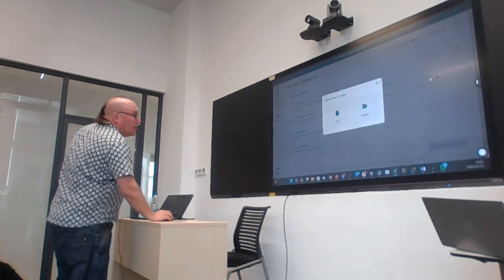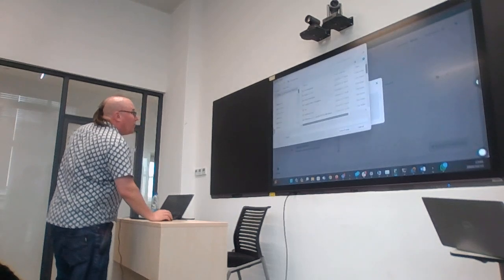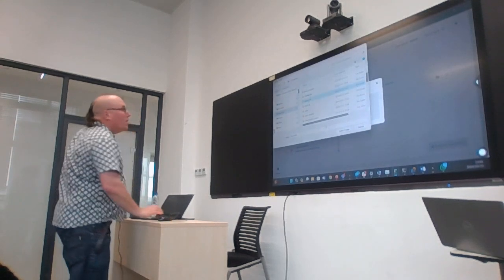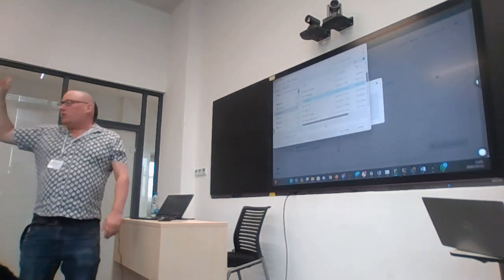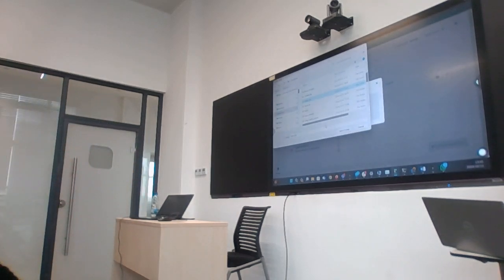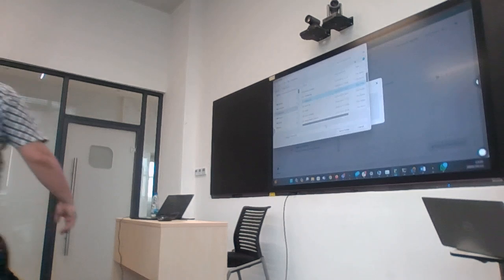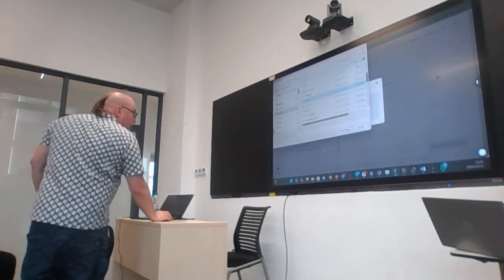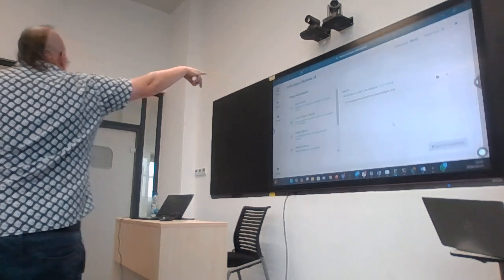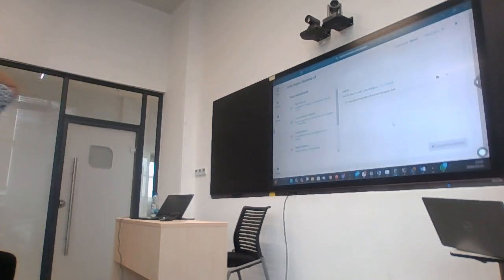So I'm going to click here and go find my folder, documents. I'm finding my folder with the one sample in, okay? Okay, so you're just finding that for that one. The input folder with the one sample. Select folder, and then it shows you here, it goes green, and it's got something selected, okay?